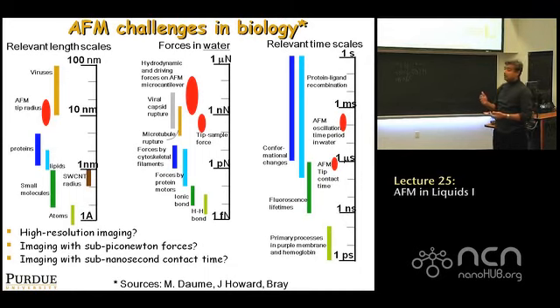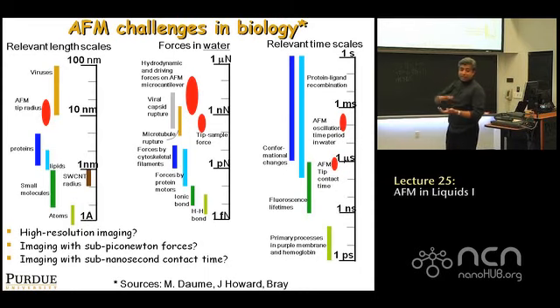So, for example, if you wanted to do an FZ curve and you move very fast, at typical speeds towards the sample, just the motion of the cantilever toward the sample makes the cantilever bend up before it contacts the sample. So in other words, your bending signal would then also be measuring hydrodynamic drag forces.